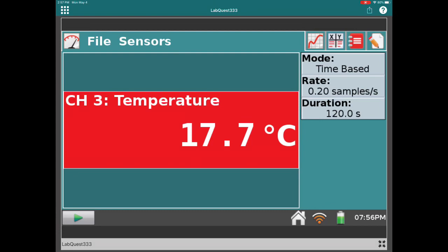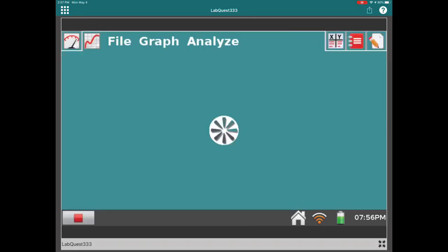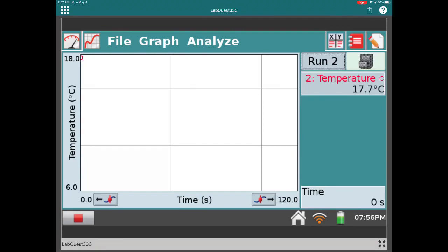Just like before, the thermometer sensor is soaking in the alcohol. We've pressed collect, and it's recording a couple of data points of the initial temperature of the alcohol. Once we've got a couple of points, we'll take this temperature sensor out of the beaker and lay it down on the countertop with the tip of the sensor and filter paper hanging over the edge in the air. Let's now see what happens as the alcohol evaporates from the tip. Compare what you're seeing here to the results we had earlier with ethanol.